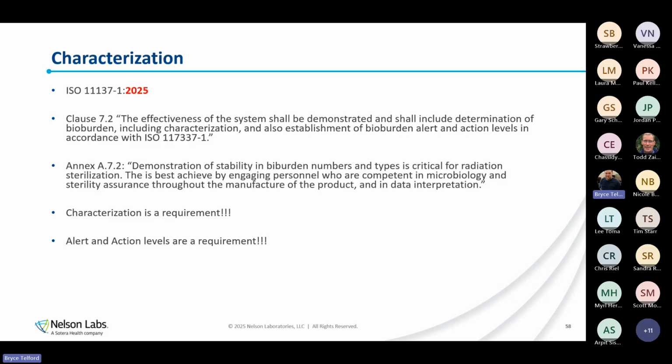If there's no colonies detected, great. I don't need to do that level of identification. If there are those pink, red, or orange, I can look and I can see, is it a Staphylococcus epidermidis, which is not resistant, or is it a Deinococcus radiodurans, which is highly resistant? And a gram stain isn't going to tell me necessarily the difference between Staph epi and Deinococcus. Both are positive cocci. So that's when something such as pink, red, and orange CFU and having it fully identified can tell me what I'm actually dealing with.